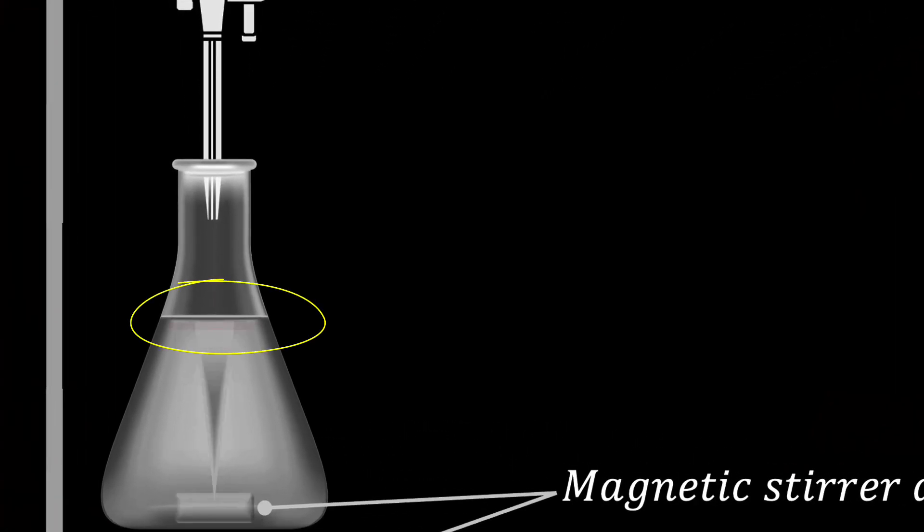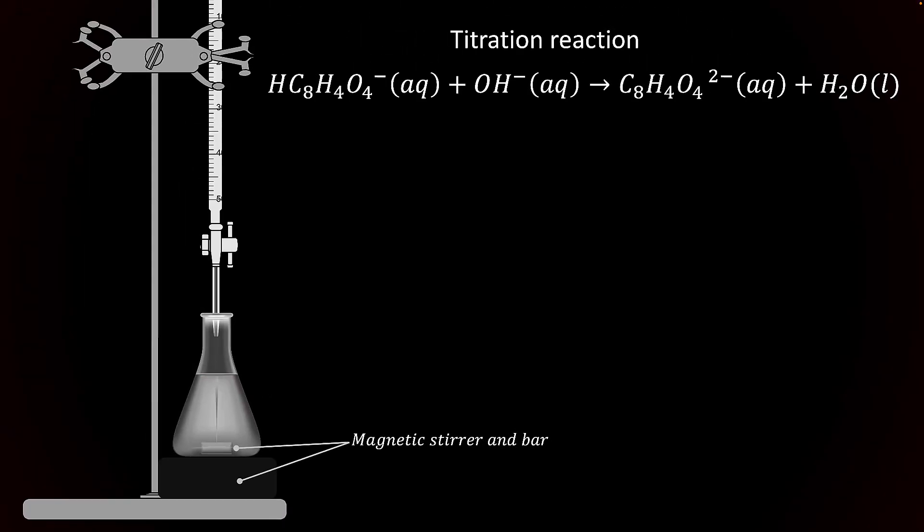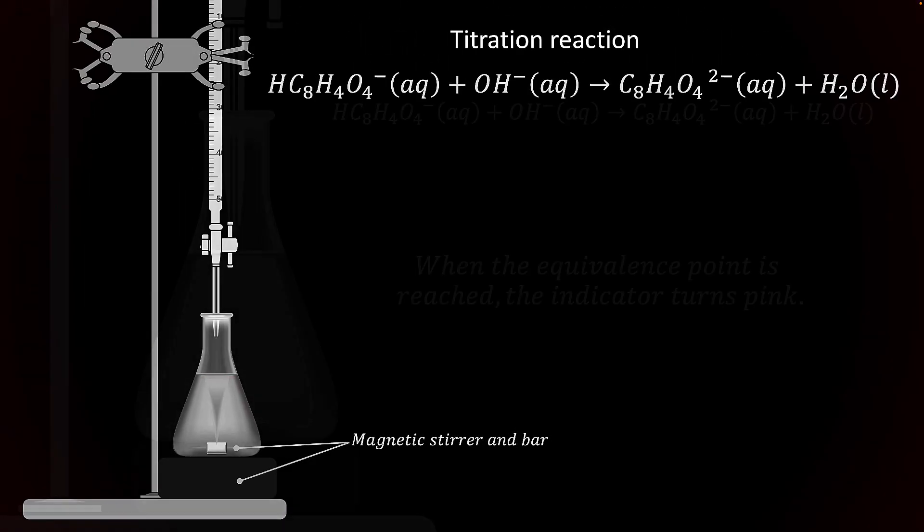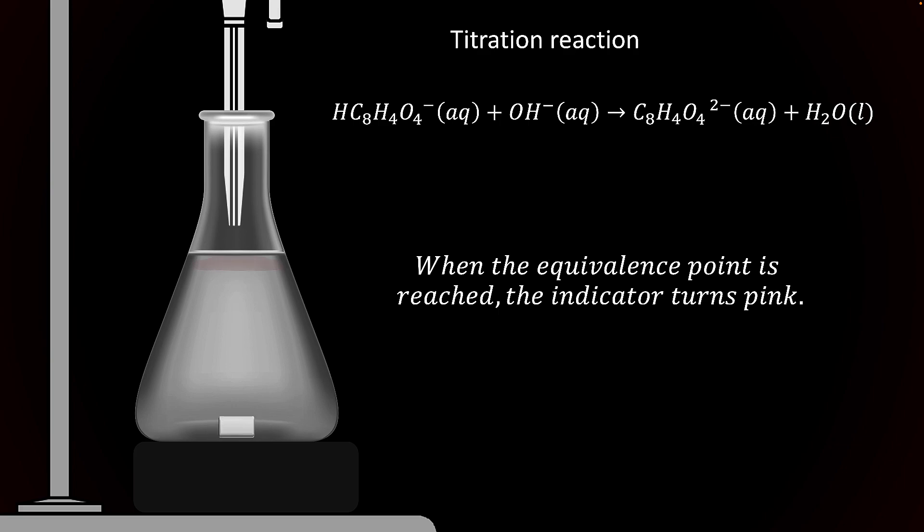You may notice that right at the top of the reaction mixture, the faint appearance of a pink color that quickly fades. At some point the pink color will persist for a longer period, and at this point you should slow down your titration to go drop by drop. The trick is to go slowly enough that one drop of hydroxide solution causes the entire solution to turn pink. At this point the equivalence point is reached and the titration is stopped.